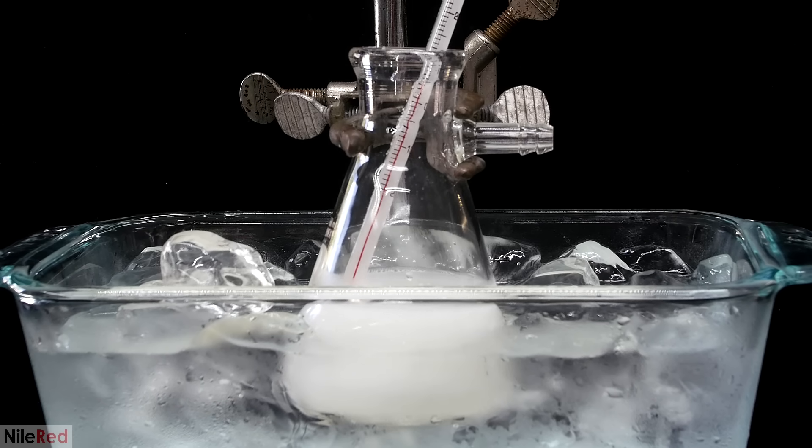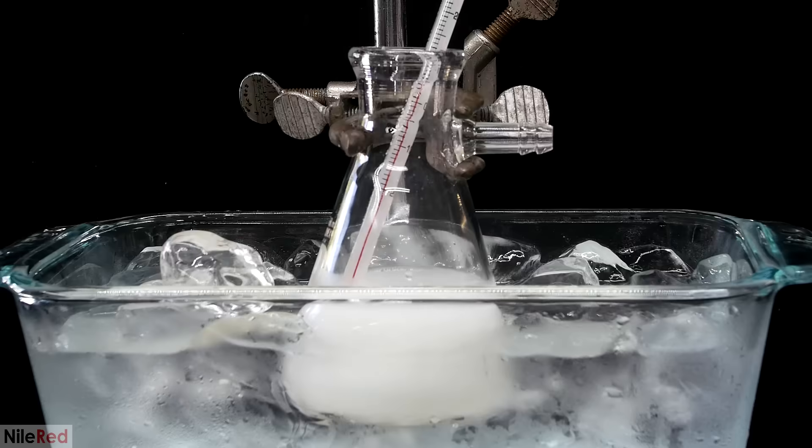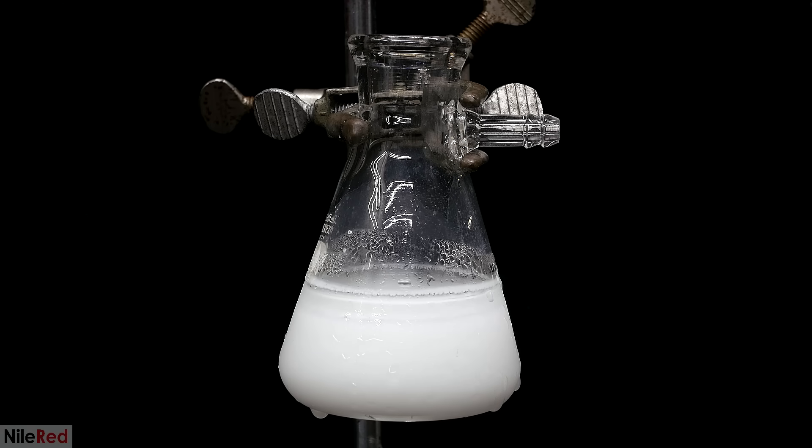When I'm done adding the potassium hydroxide, I leave it in the ice bath and continue to stir it for about an hour. When it's done, I remove the thermometer, and it's time to filter things off.